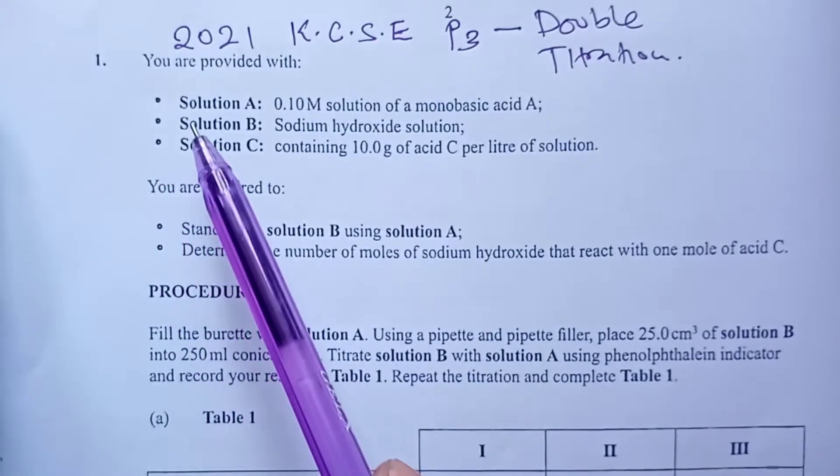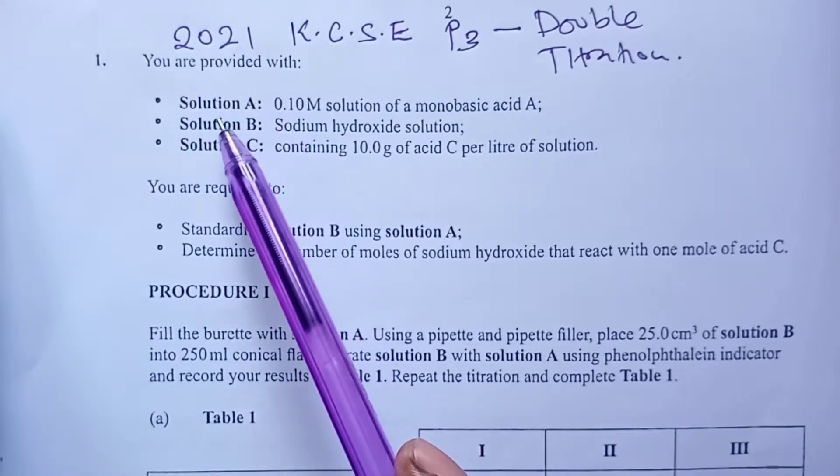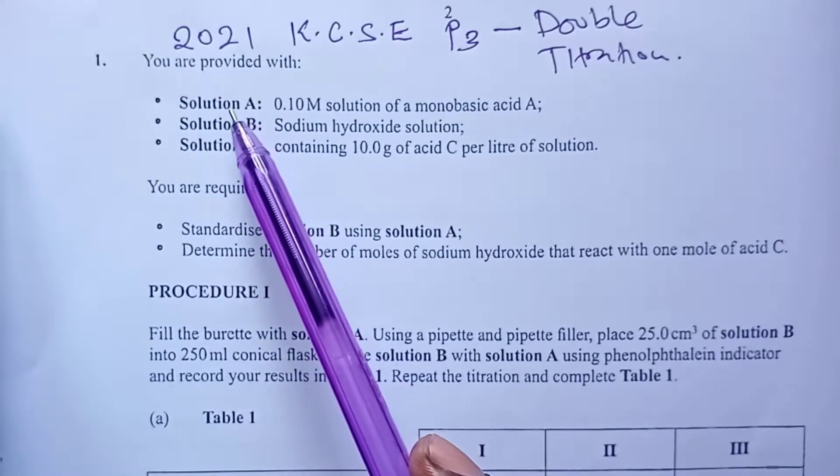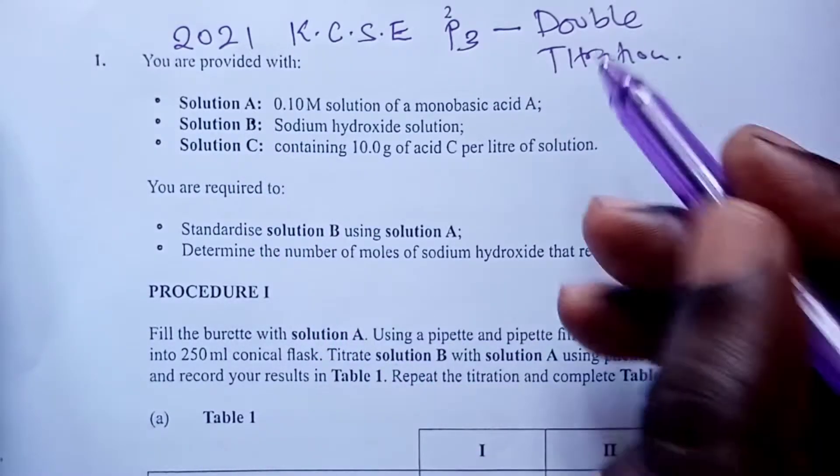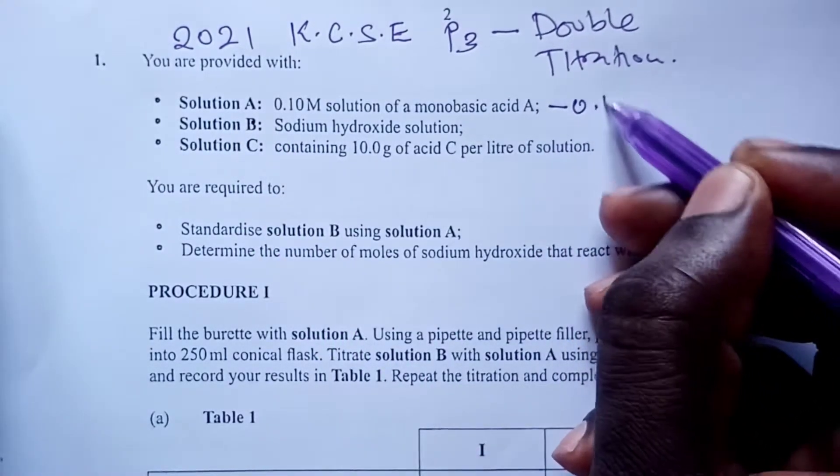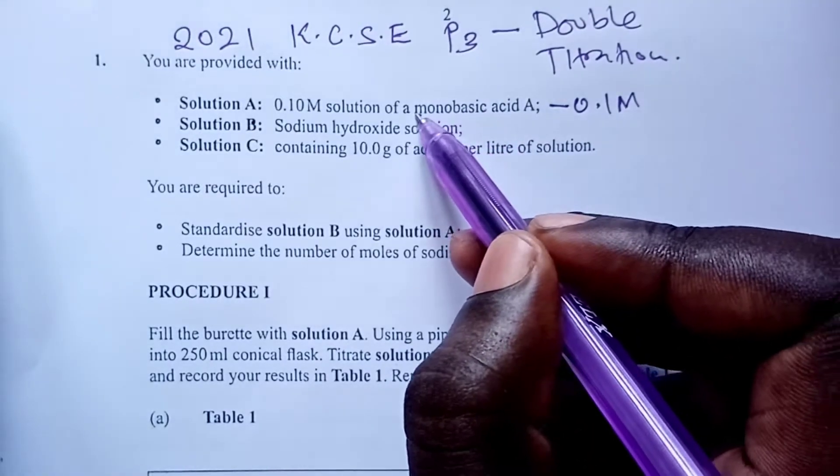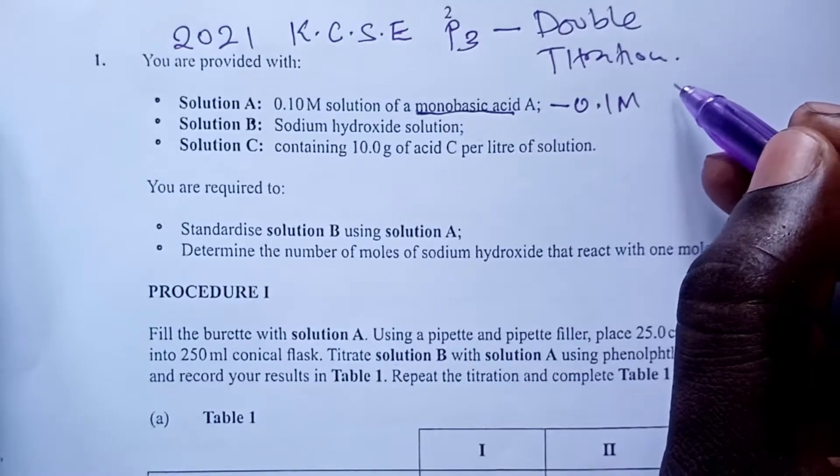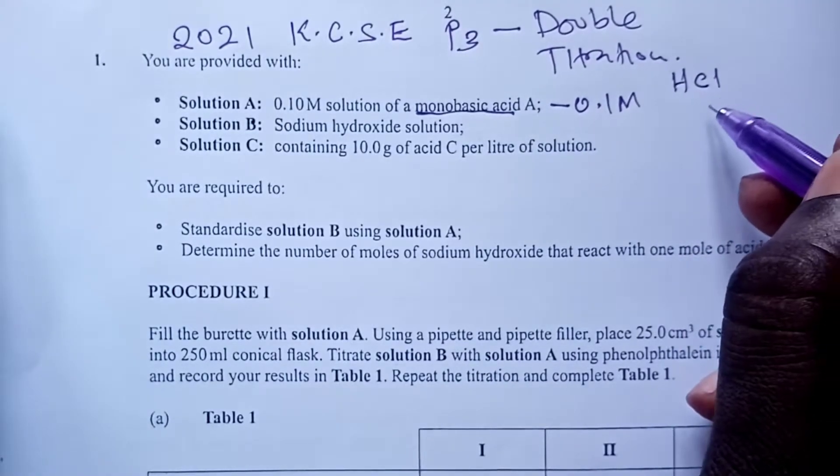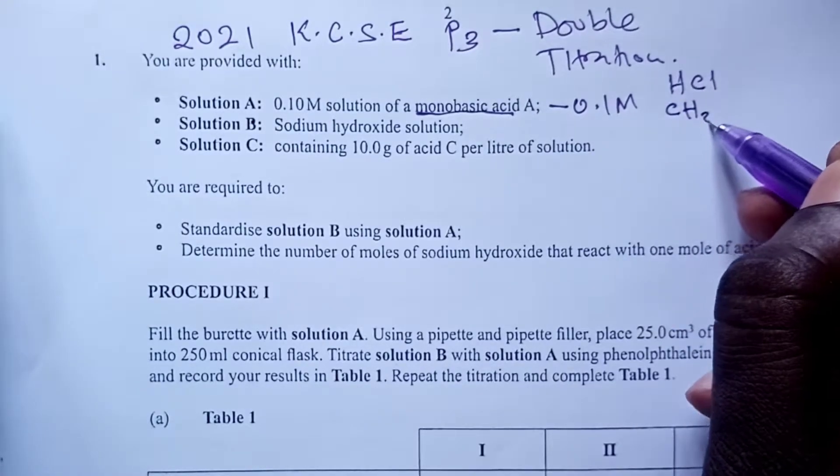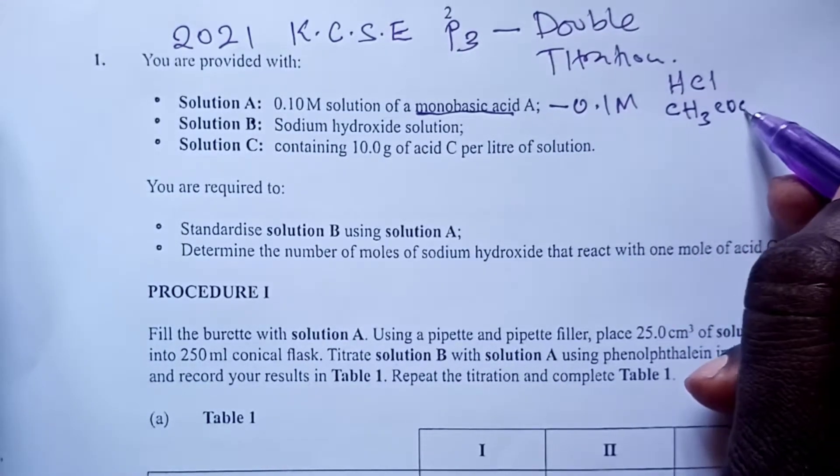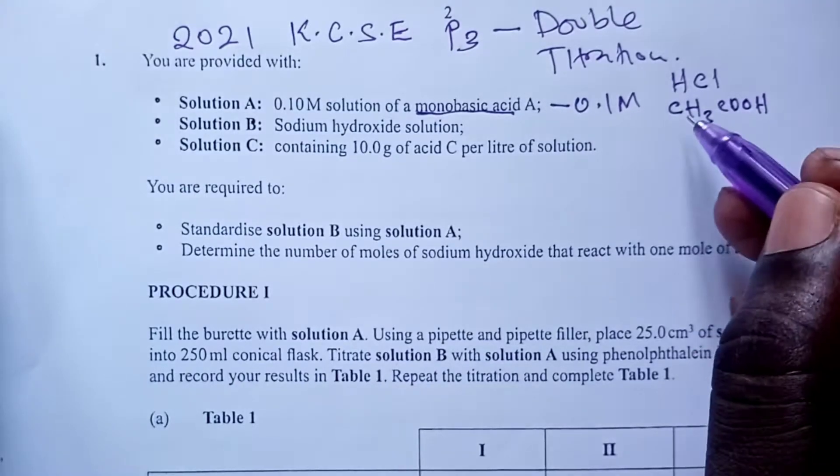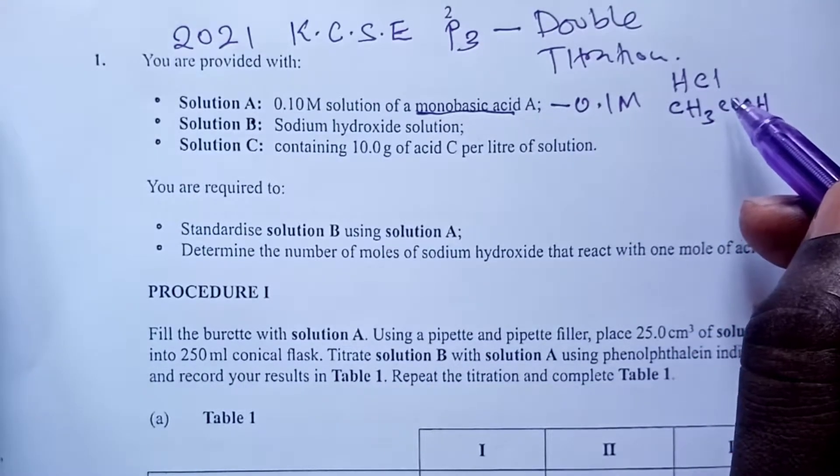And the question read, you are provided with three solutions here. Solution A is 0.1 molar solution of monobasic acid. A monobasic acid is one that has one replaceable hydrogen atom. For example, HCl, we also have ethanoic acid being monobasic. But because here we do not know what was there, we shall generally write it as HA to mean there is one replaceable hydrogen atom in the acid.